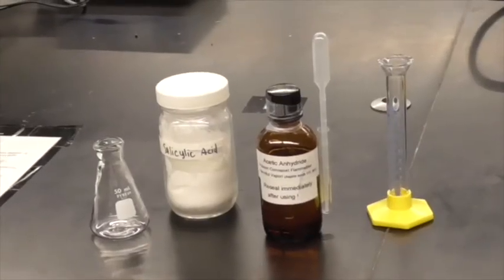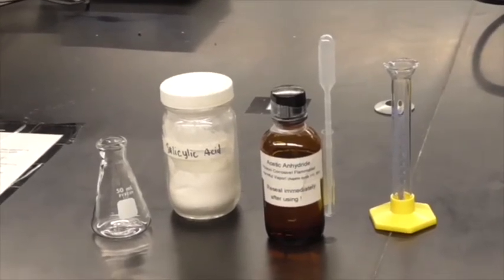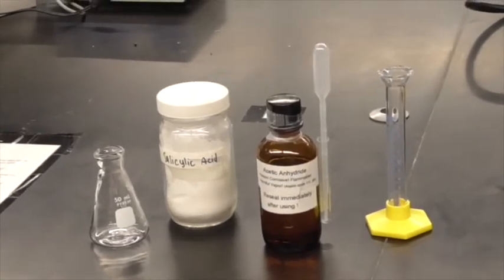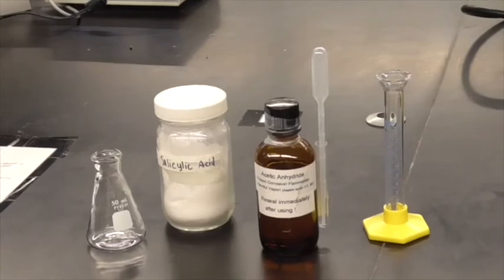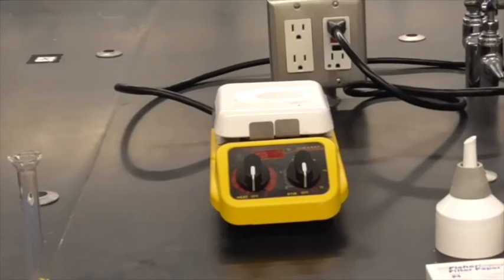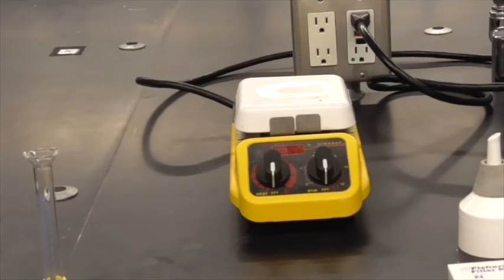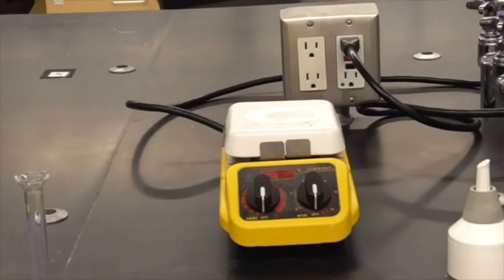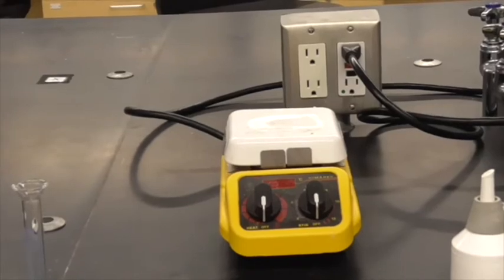Alright, here we have our two reactants, salicylic acid and acetic anhydride. We have an Erlenmeyer flask, 50 milliliters, that we're going to put the salicylic acid in to do the reaction. And because we need 5 milliliters of acetic anhydride, we have the graduated cylinder that we'll use to measure the 5 milliliters. Next to that, we have a hot plate, and the hot plate is going to let us heat our reaction very briefly, just to get the reaction going a little bit quicker. But we're not going to heat it very much, because if you heat it too much, it burns your sample.